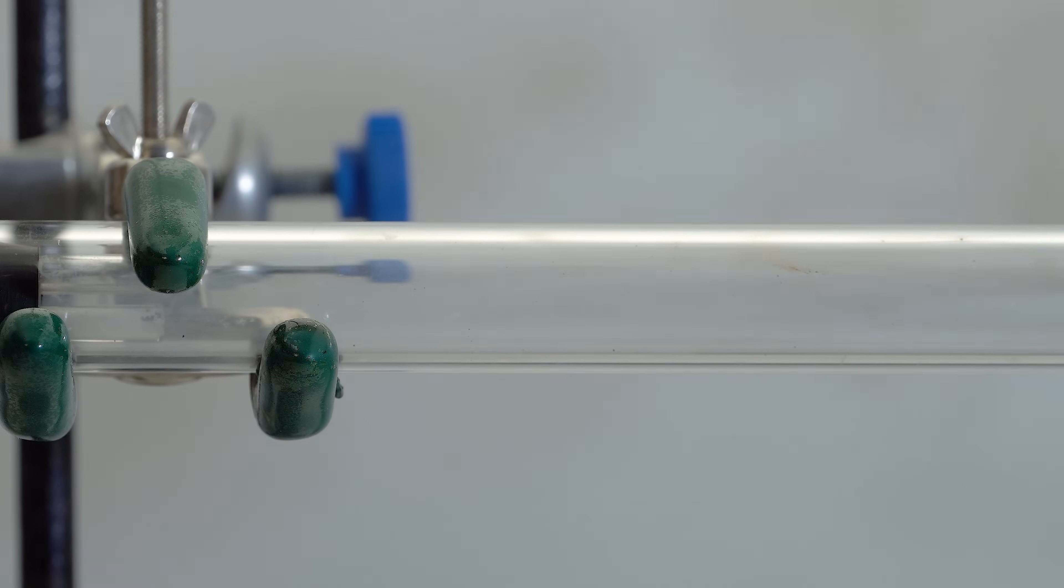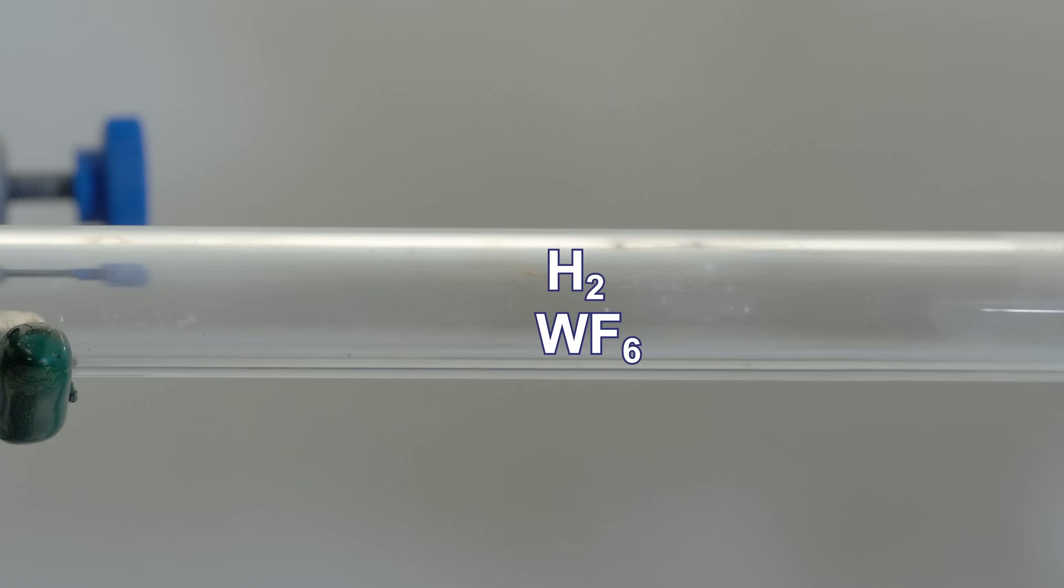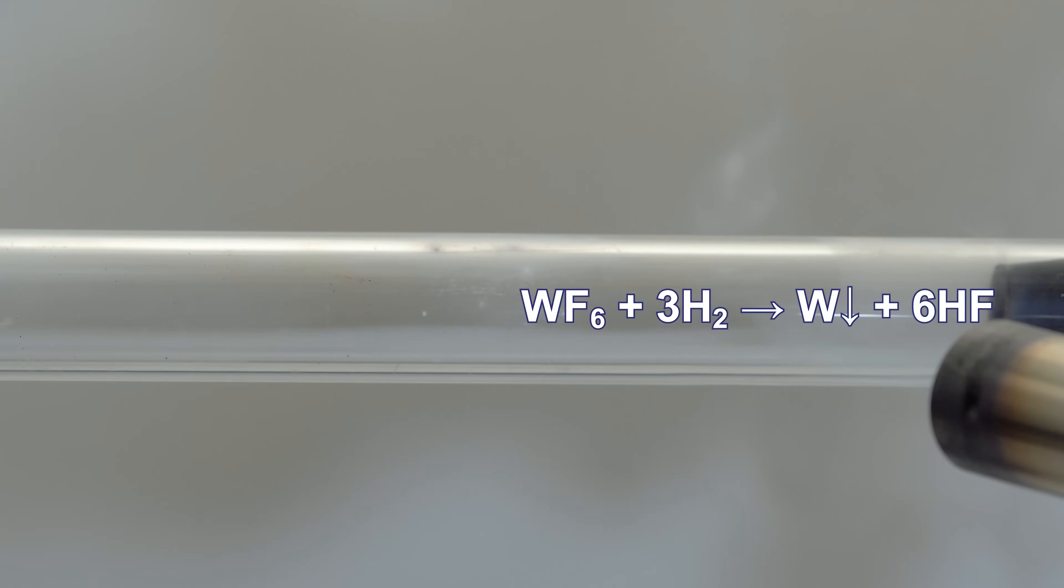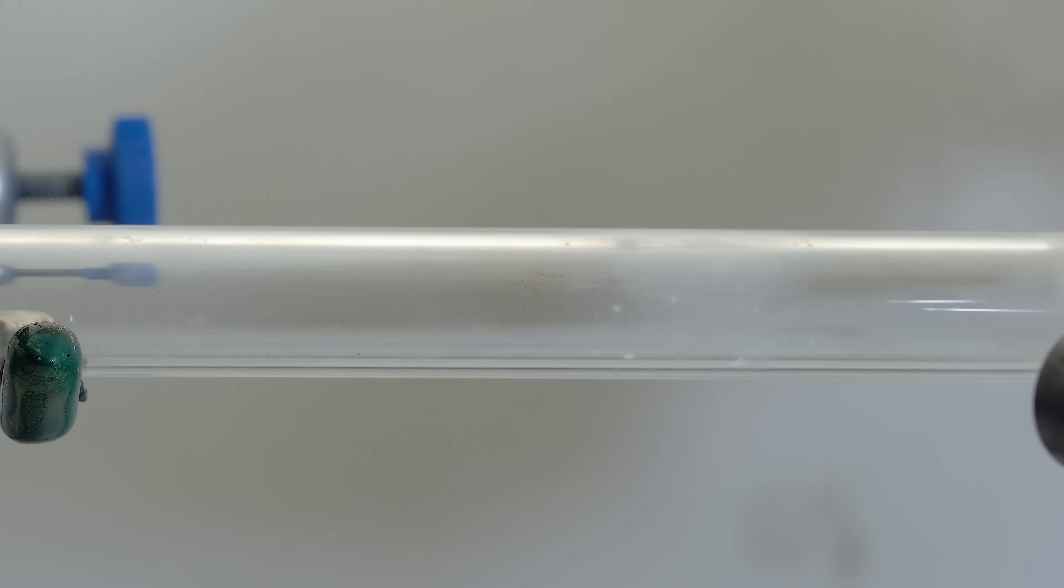Now I turn on the current of tungsten hexafluoride and strongly heat only a small part of the quartz tube with my butane torch. It's in this heated section above 500 degrees Celsius that pure tungsten begins to precipitate, forming a layer of metallic mirror.